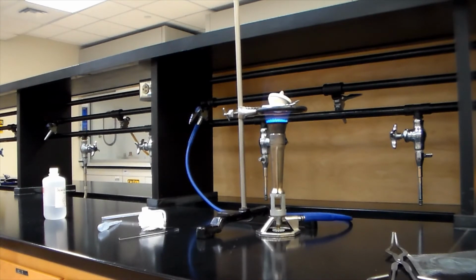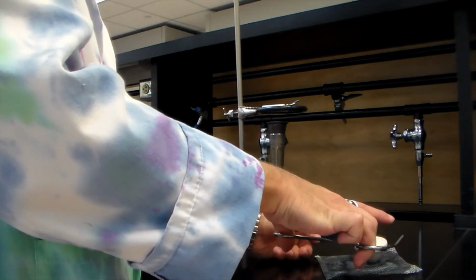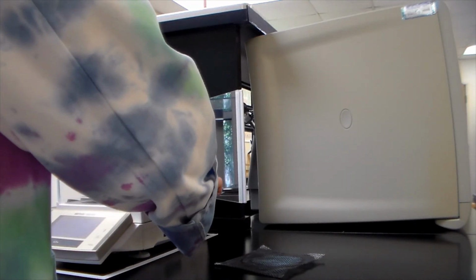Remove the flame, cover the crucible, and transfer it to the wire gauze. Allow the covered crucible to cool to room temperature and record its weight. Do not weigh a warm crucible. Return the crucible to the iron ring, slightly open the lid, and heat with an intense flame for 2 minutes. Repeat step 18. Repeat step 19 until constant weight is achieved.